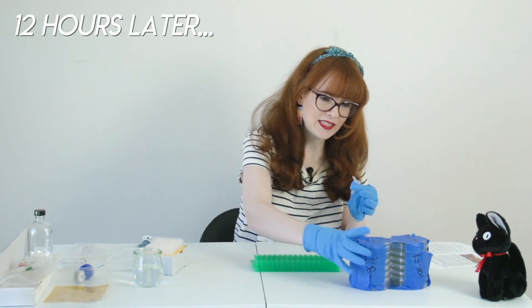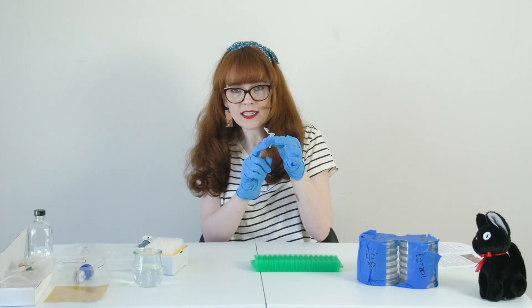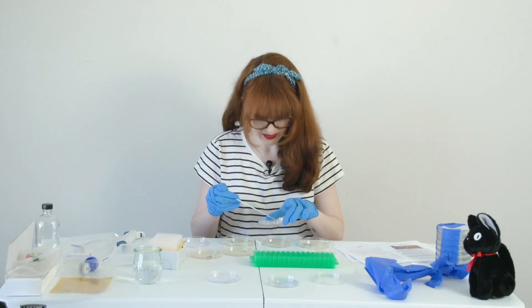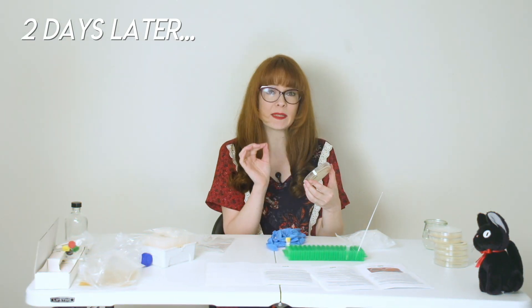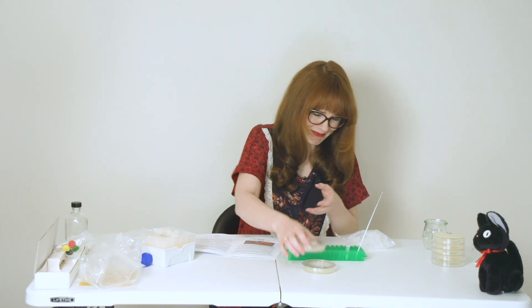Our agar plates have been sitting in the fridge overnight. We're going to put this yeast on the agar plates — it smells kind of like burnt microwave popcorn. It looks like it has successfully grown; we were told to look for little white spots, and we've got a bunch of them here. It smells really awful.